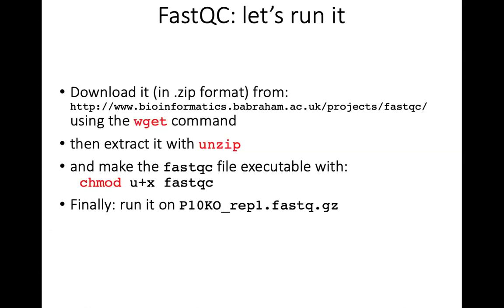So I did the wget twice. Oh no, actually, if you do wget on the website, you're doing wget on the website, so what you're loading is the website itself, like the HTML page. If you go to the website, just copy paste the address here. Well, if you click directly, you have copy link, and if you go to the terminal and paste that. So just paste it.